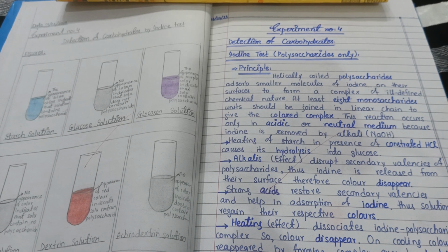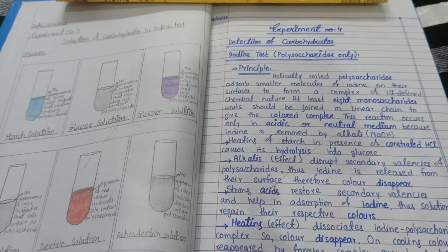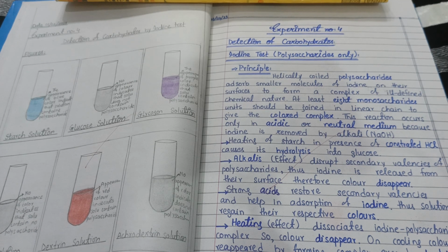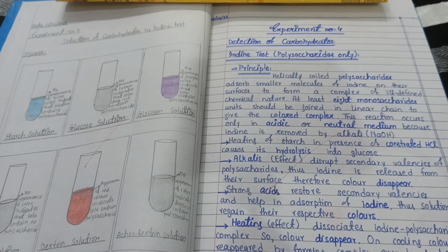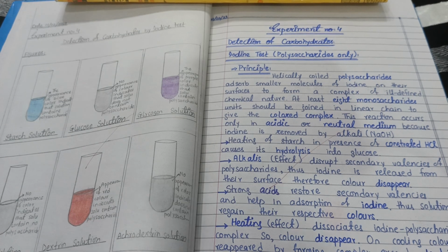Okay, so the principle of this is that your polysaccharide is helically coiled on each other. So they absorb the iodine molecules into them. Therefore this test is performed only on polysaccharides because of their helically coiled structure. Now your polysaccharide must have 8 plus monosaccharides in their structure, so that they could form the colored complex.